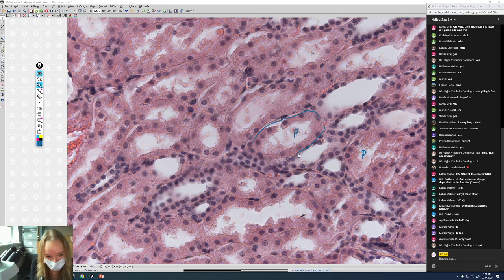These cells are sitting on the basement membrane right here around, but there is also a tissue around these tubules. A loose connective tissue. It's small, you cannot really see it, but you can see it right here. There is loose connective tissue all around the tubules. Interstitium.